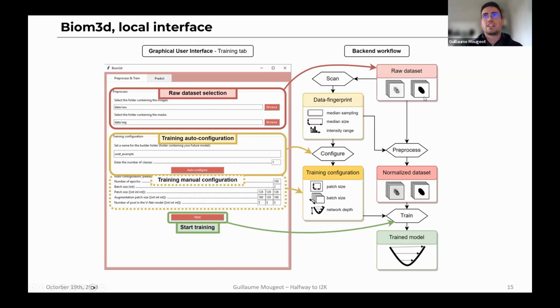For instance, it could be anything else, but you need these masks, so these black and white pictures or grayscale level pictures that represent your object of interest. You don't need many for 3D images; it usually works with below 100 pairs of images. So often people ask how many images are required to have a good training data set.